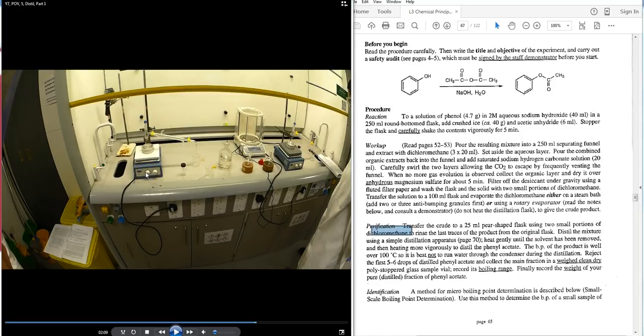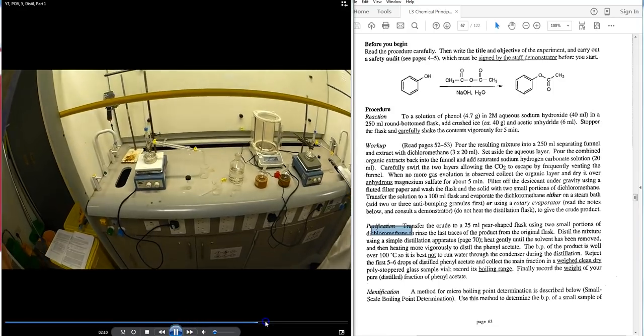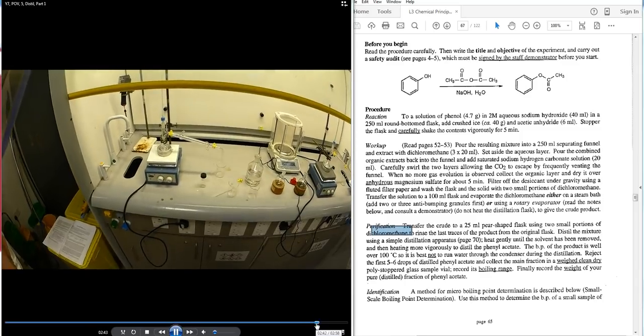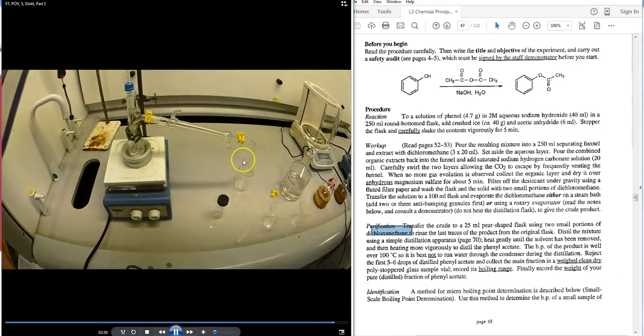Distill the mixture by gentle heating to around 100 degrees on the heating mantle. The boiling point of phenyl acetate is over 100°C. First, set the temperature to three, four, or five to remove traces of DCM, which boils at 40°C — collect these initial drops into a waste beaker. Then increase the temperature setting to collect the phenyl acetate.